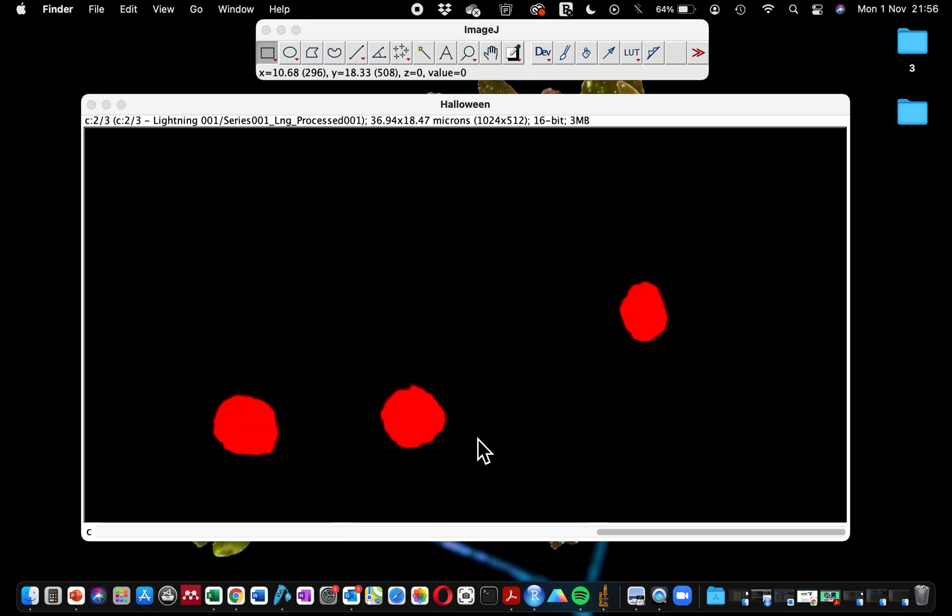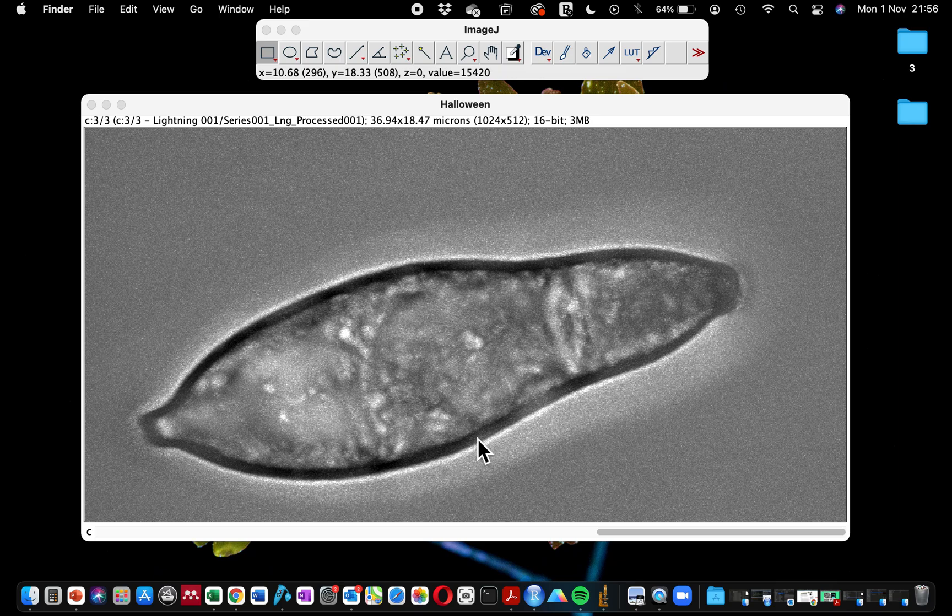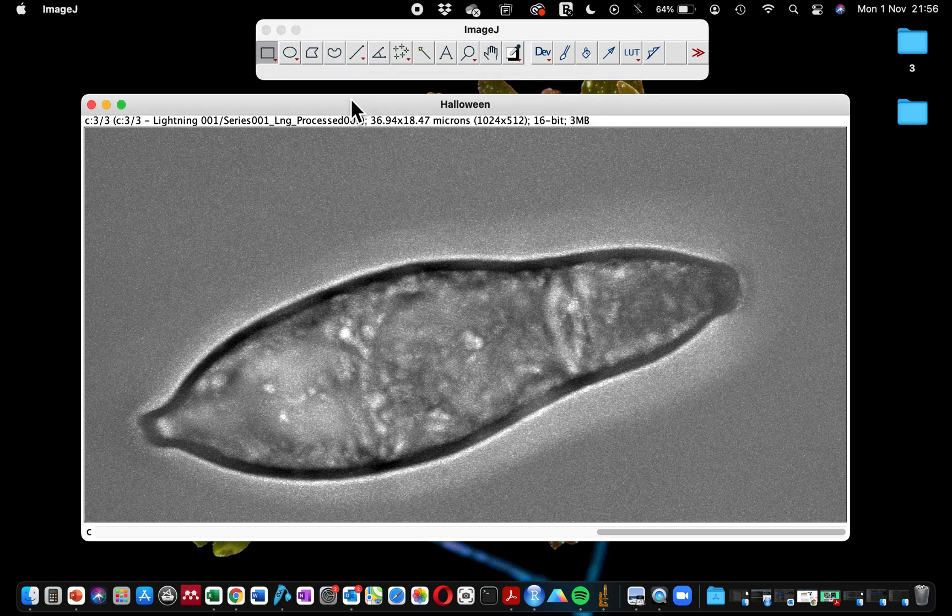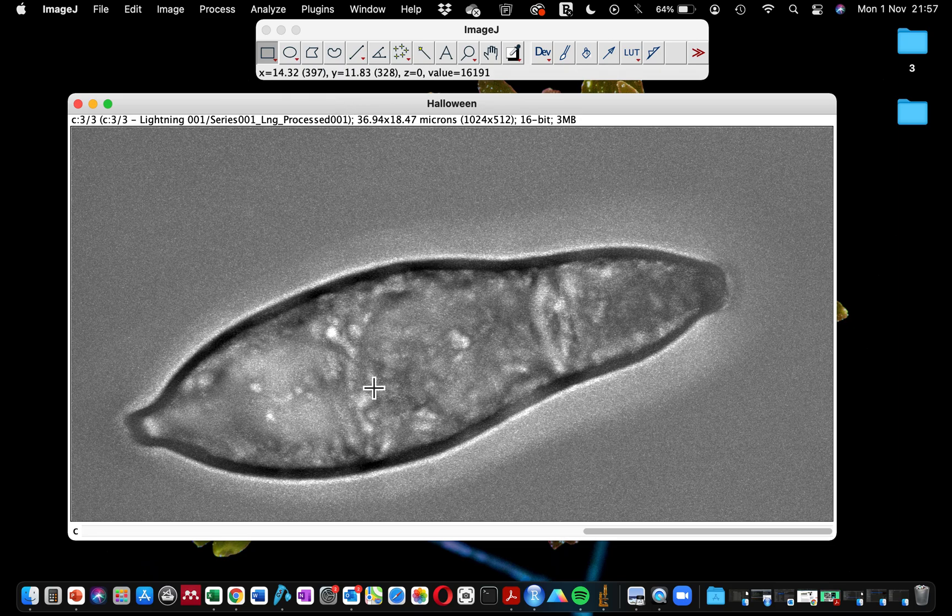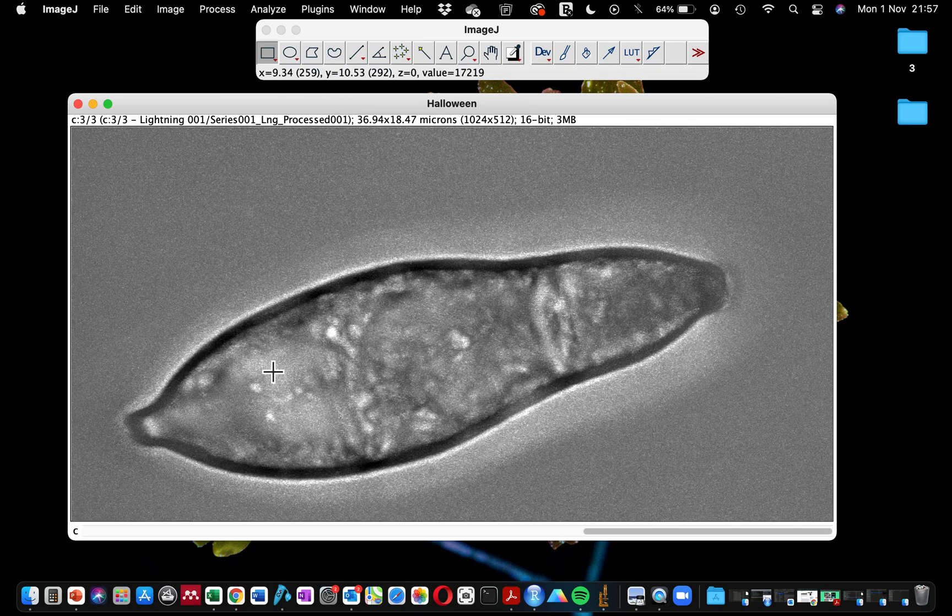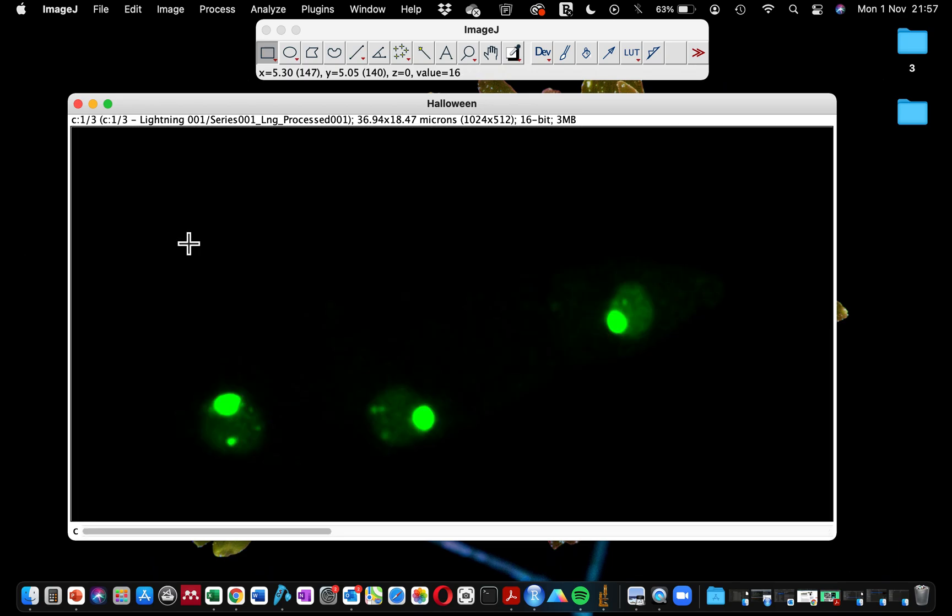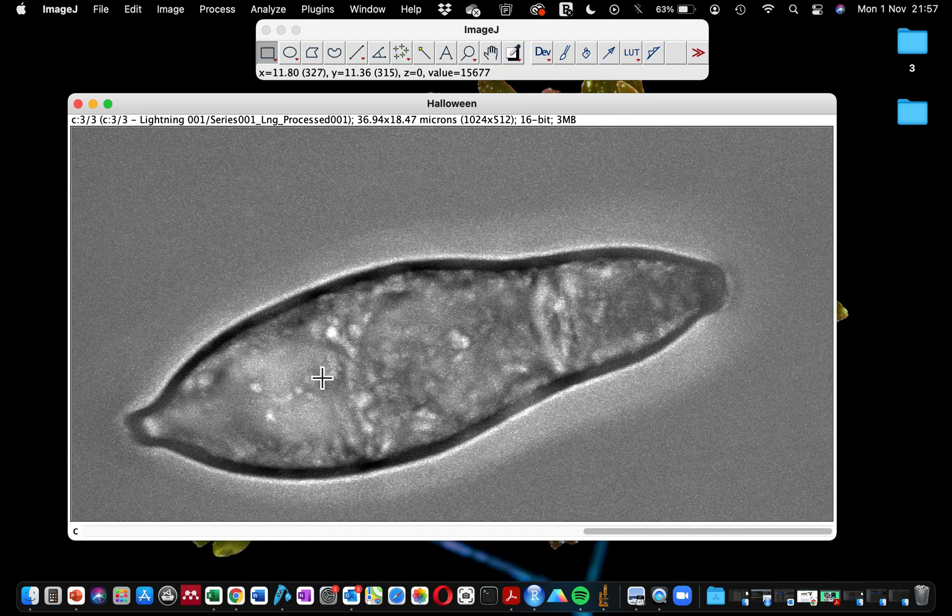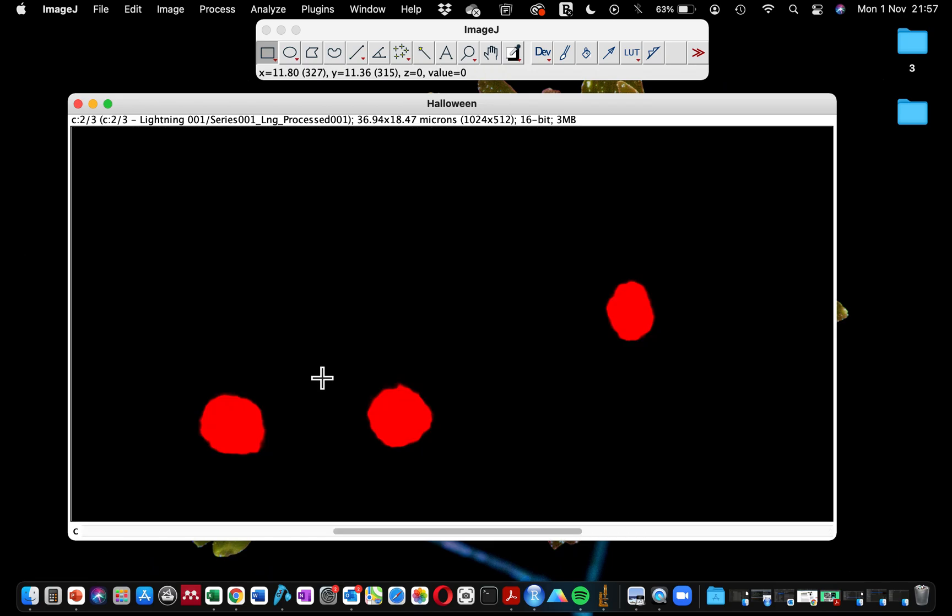I've had this problem, and that is why today I'm going to provide you with the solution that works for me. Here I have my microscope image opened. This is the spore of Magnaporthe, and this sample has the green fluorescence channel and the red fluorescence channel.